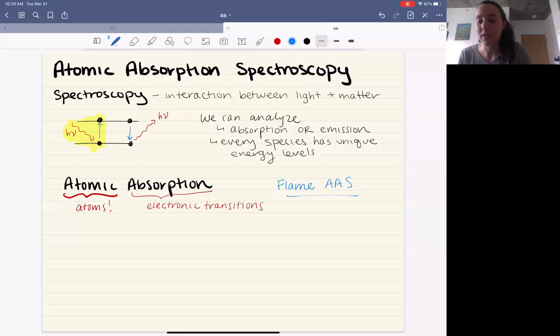So we're trying to determine the concentration of calcium in seawater. One reason that's important, calcium carbonate is what a lot of shelled ocean life uses. Calcium carbonate is their shell, so the concentration of calcium in seawater is important for those creatures.